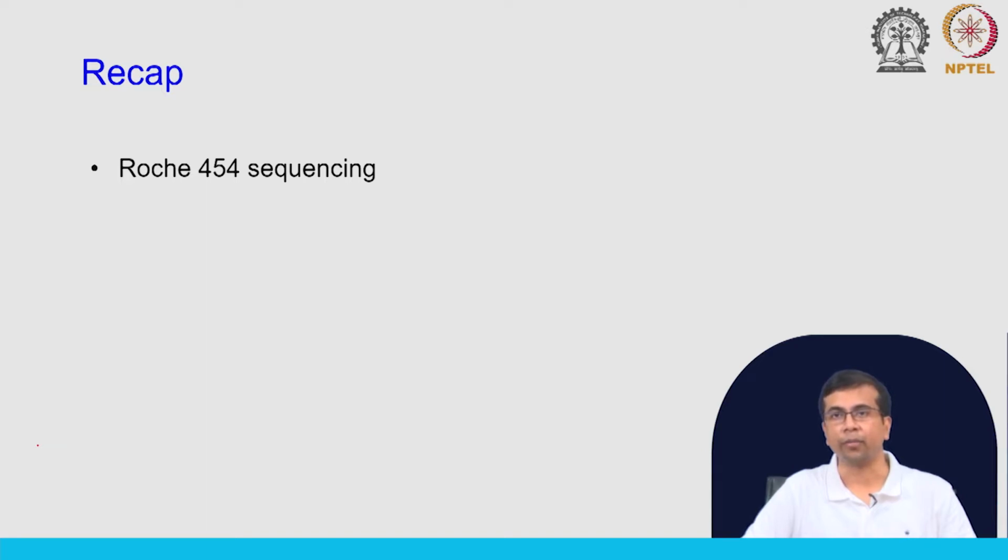Now, one of the first things you probably remember is that we need to amplify the DNA, right. When you prepare the library, we have to do some amplification. In 454, this is the emulsion PCR, which will generate multiple copies of the same DNA molecule on the bead. And the average signal for all the syntheses that are happening on a single bead is detected as a pulse of light. So, the assumption is that all the syntheses across these molecules on a bead are happening simultaneously, and the signal comes together and will be detected.